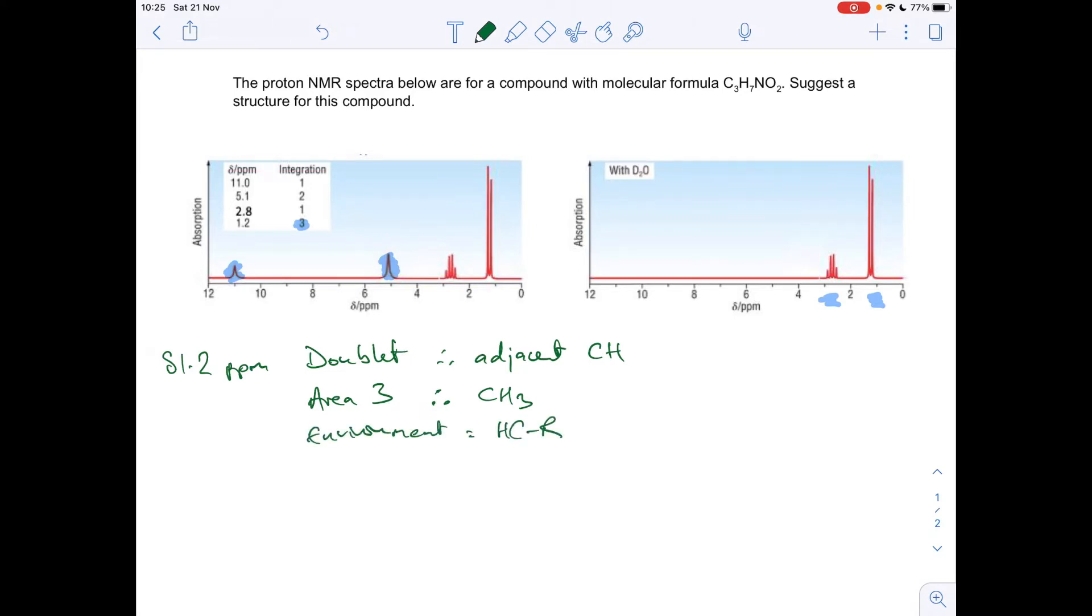So what that means, we can build a picture now of this little bit of the molecule. So what's causing that signal, that doublet, is a CH3 from the area of 3. And next to it, adjacent to it, is a single hydrogen on a carbon. So there's that little piece of the molecule there.